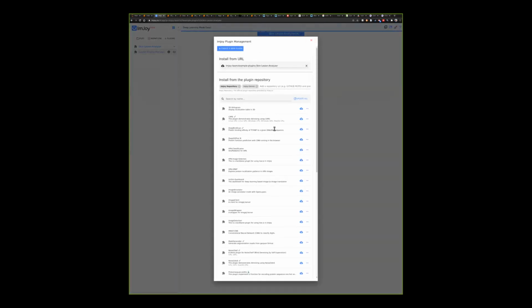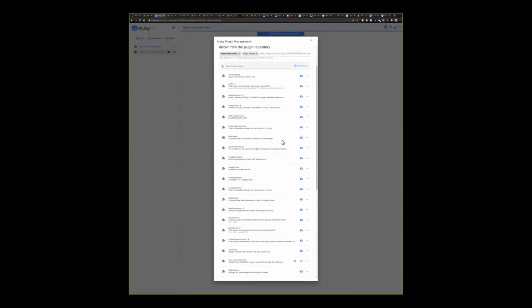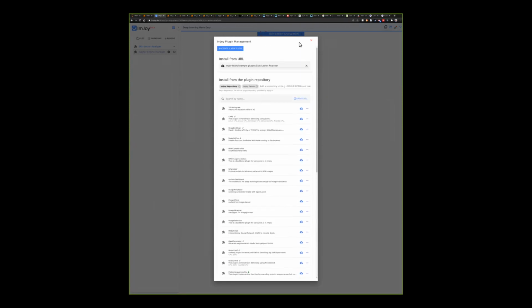And then we can combine this with other plugins. We can add new plugins here. There's many that are shareable. And we can also create our own custom front end. So if you wanted to create a custom application with its own front end without all this stuff, you can do that and share that with another biologist or someone that you're working with who's not very technical. And then they don't have to install anything, and they can do some really powerful analysis of their images.